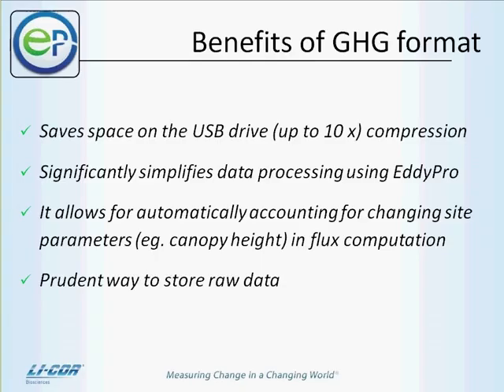The original model of the OpenPath analyzer, however, can be upgraded so that it can work with the new analyzer interface. This upgrade also allows you to collect data on the USB in the file format we discussed, but also provides you the optional benefits such as Ethernet connectivity to your gas analyzer.